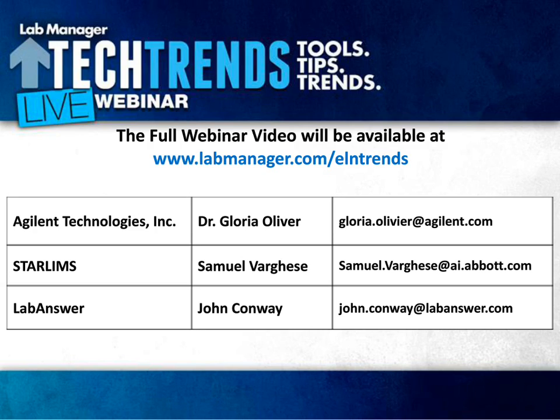I think LIMS systems are very attuned to analytical support and method development labs, whether it's preclinical or clinical bioanalytical labs. A lot of times it's method driven, but a big part of it as well is the tracking of not just the samples, but the data behind the samples and the metadata associated with those. But Gloria's right about the structured versus unstructured as well.